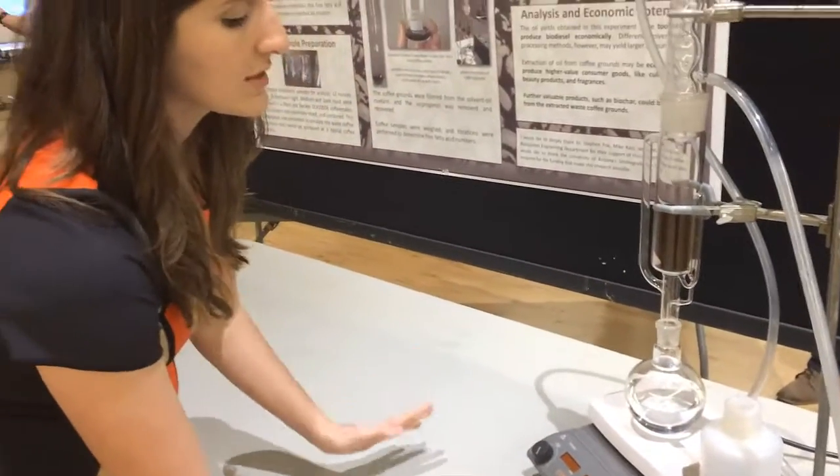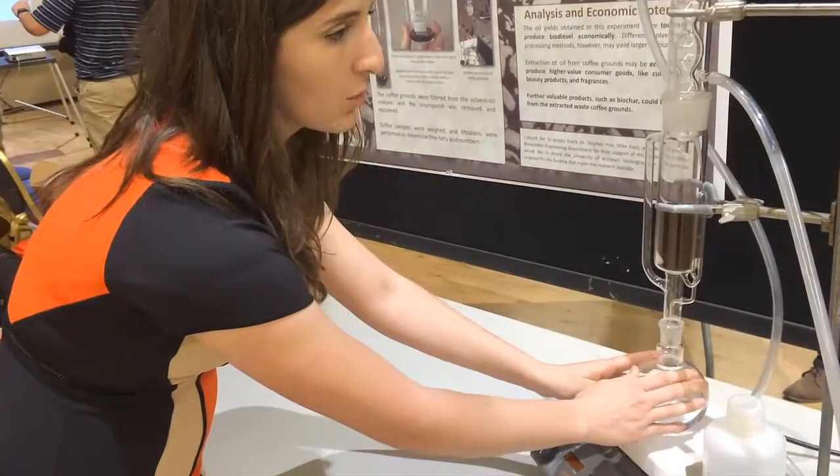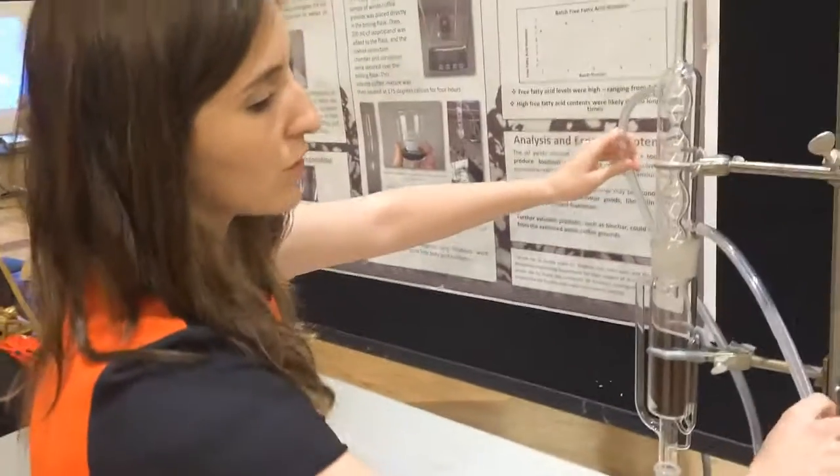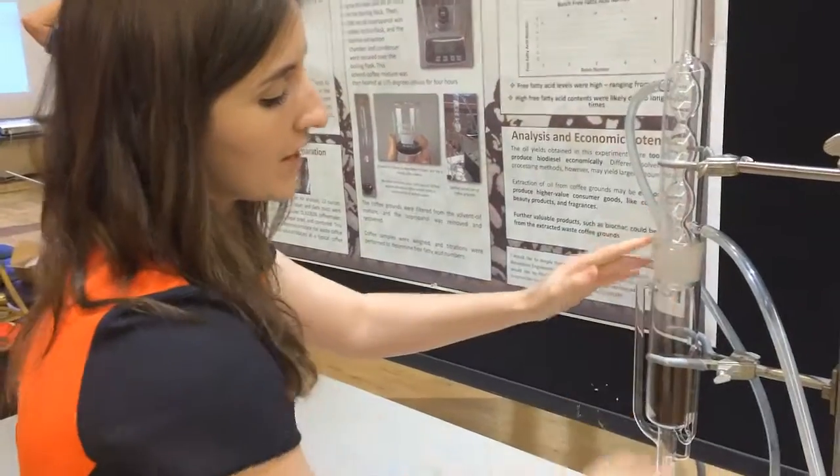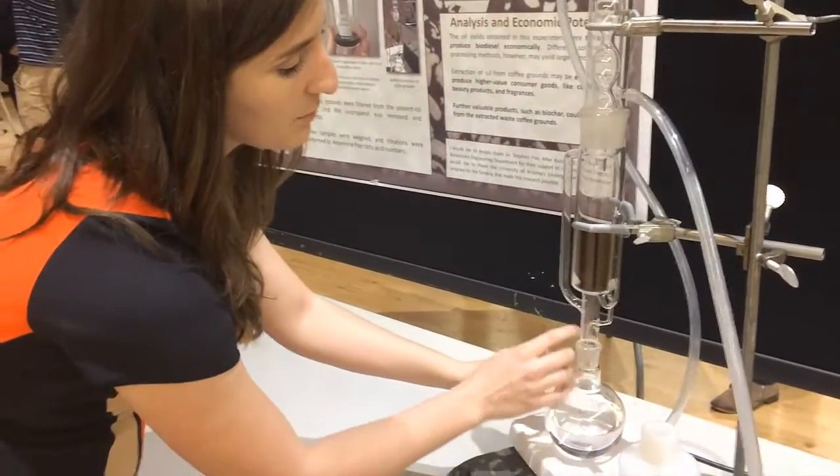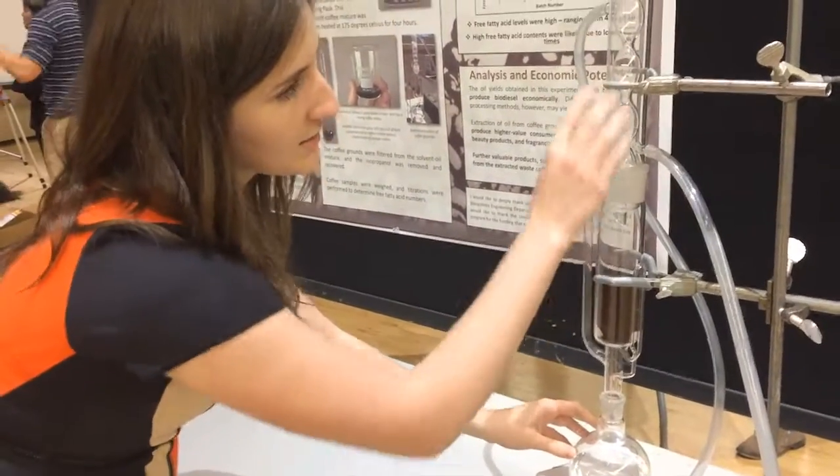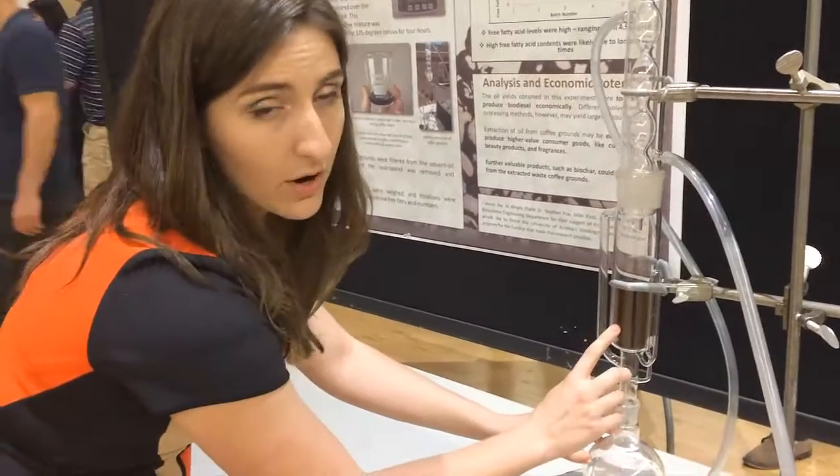So the way this works is that you have the solvent heated in this bulb, and then you have very cold water running through the tubing from a condenser. Basically the cold water runs from here, and you have the solvent evaporating up through here, and it's condensed and it falls down onto the coffee grounds.